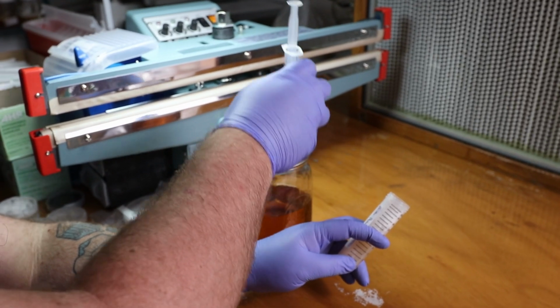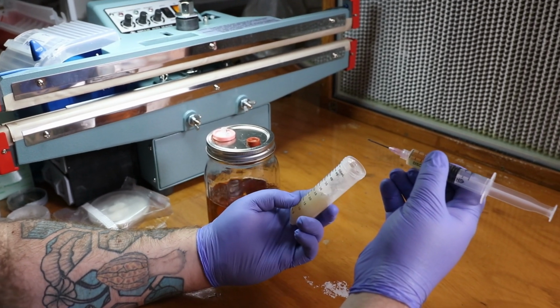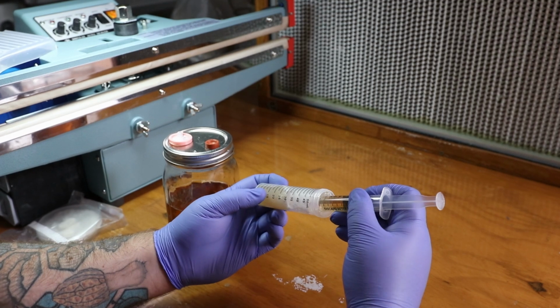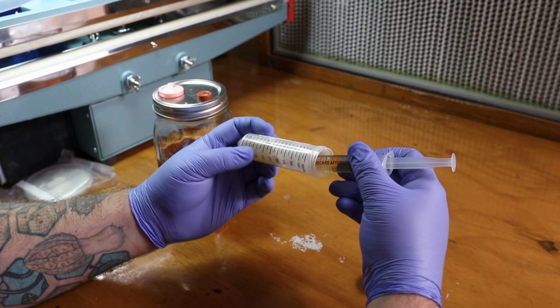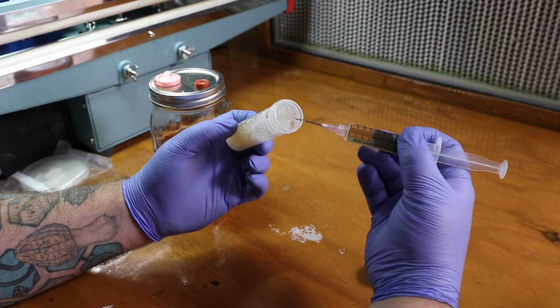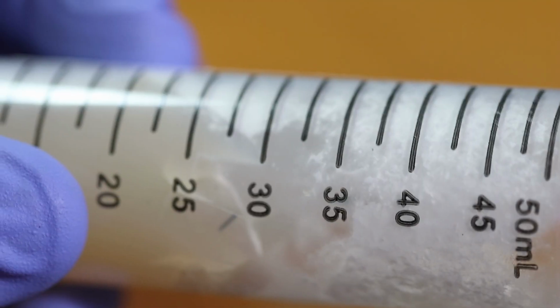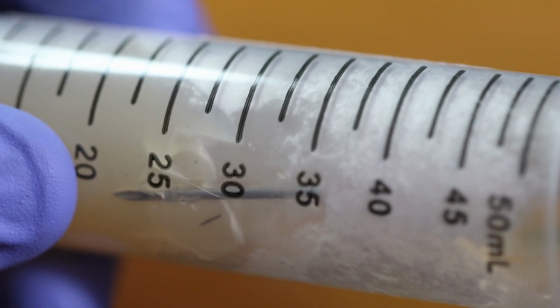We're then going to take that needle out of the jar, and now we're going to find the highest side of the slant, and I am now going to take this needle in and I'm going to mush, not stab. It's an important distinction. Here we'll get a close-up for you. But you're going to take that needle in, you're going to orient the needle where it's flat. The angle of the needle comes in flat. And if you see here, we're just going to smush down real hard.